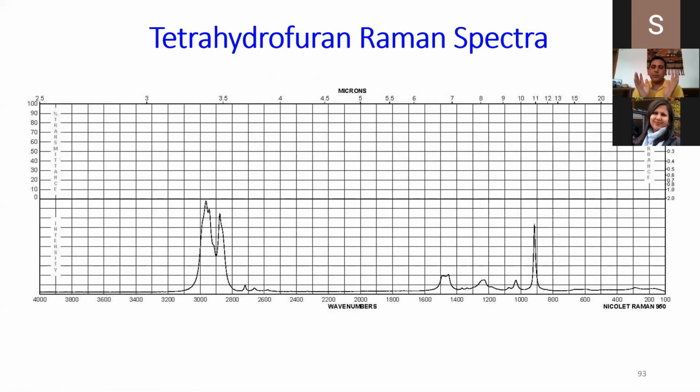So these are three characteristic peaks which are not present in the other samples. It means you have to choose the compounds in such a way that each has at least one peak which is not present in the other samples, in order to quantify them. Just like three boys in a class, all with their faces covered. Only then can you identify them by their colors. Here the colors are the peaks. If you have different colors or different peaks, only then can you identify them, right?